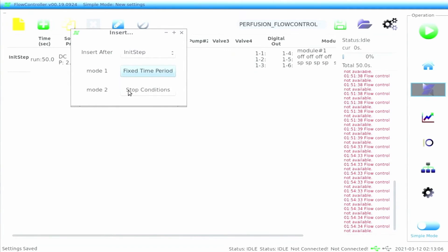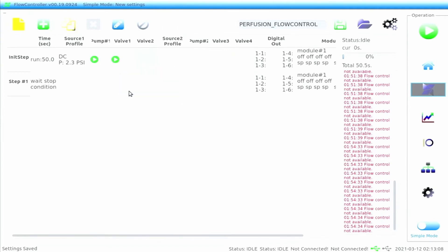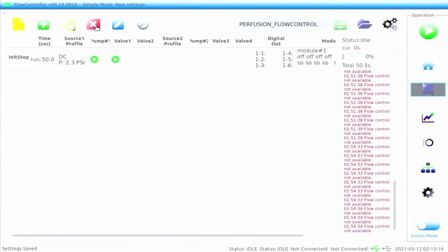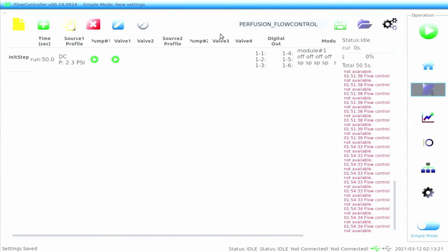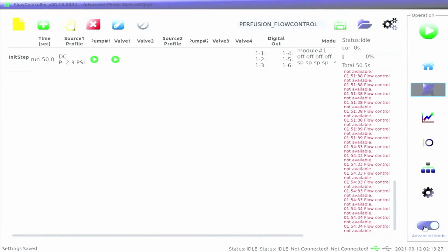The user can either add a fixed time period condition or a stop condition. The red X icon when pressed will delete an entire selected row, and the yellow icon adjacent to it will copy a selected row. After making the script, the user must toggle on the advanced mode slider on the bottom right of the screen prior to running the script.